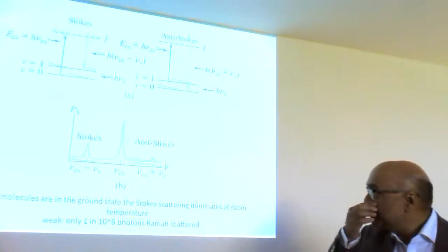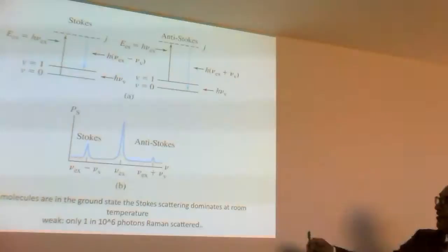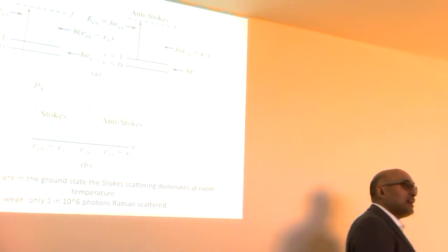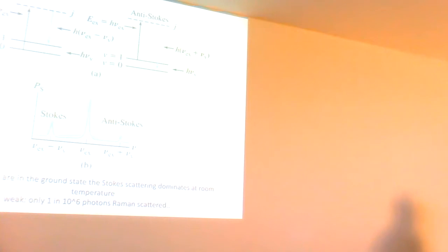And so, if you do that, this is what you might get. This is the same diagram. There's my Raman excitation, and then I might have a Stokes or an anti-Stokes. I plotted that in frequency space rather than wavelength, but you get the idea.